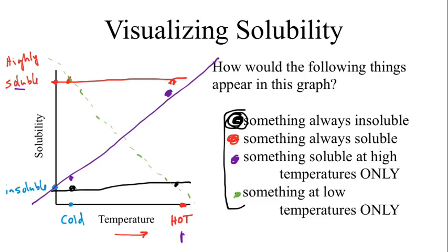Well, probably not, considering that as we add heat, we break intermolecular forces. So solubility breaks intermolecular forces. You add solvent and heat, it should really actually increase in solubility. There can always be exceptions, but that's primarily going to hold true. Okay, that really doesn't make sense.